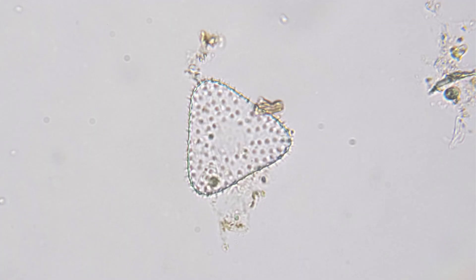Such as this one, which I believe to be a cousin to Lycumophora. These organisms, when placed in an enhanced dark field, refracted rainbows of light like microscopic quartz prisms. And in direct light, the fine and amazing structures of diatoms became apparent.